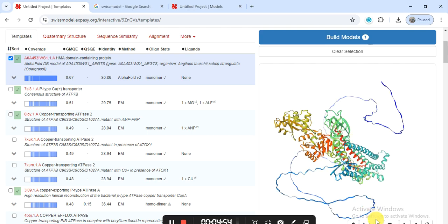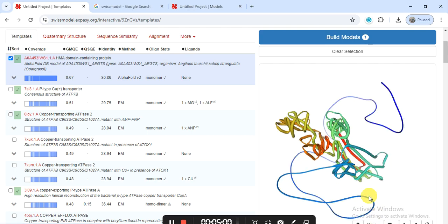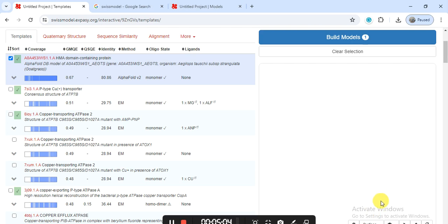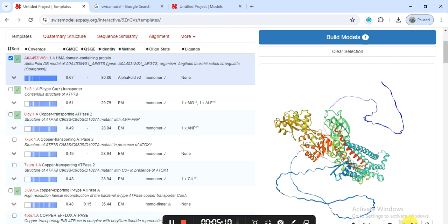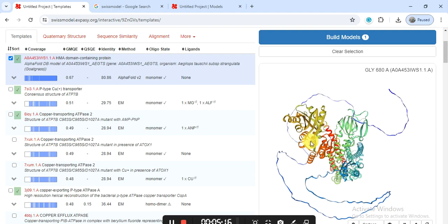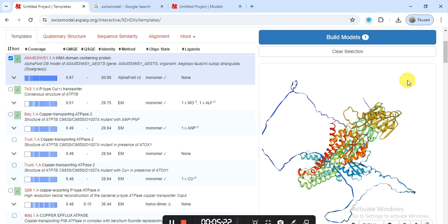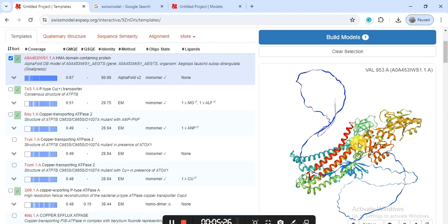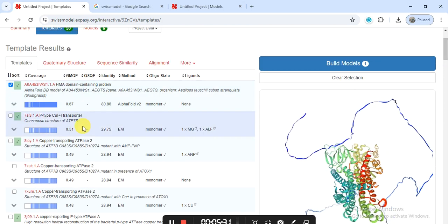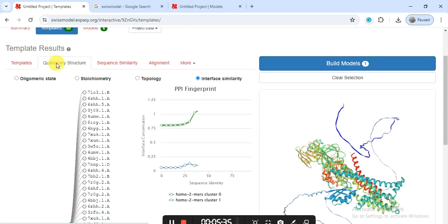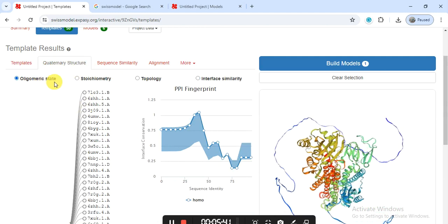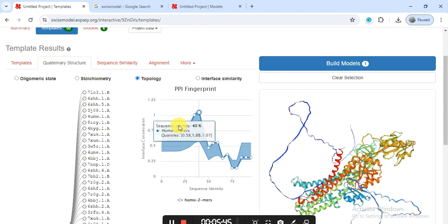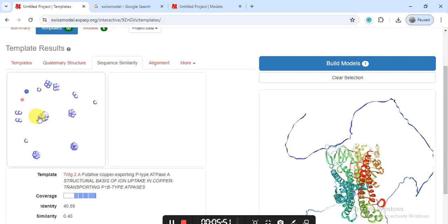You can take it and from this play button, if you press it, it will start playing. And if you keep the cursor on any place, it will give the detail of that, which amino acid, which number it comes, and it also contains some other information. Here is the quaternary structure, the oligomer state, stoichiometry, topology. Here is also the sequence similarity graph it shows, and this is the alignment. These information, also if you want.